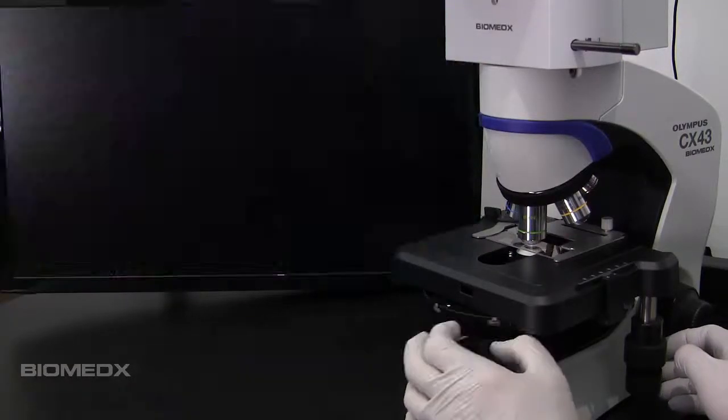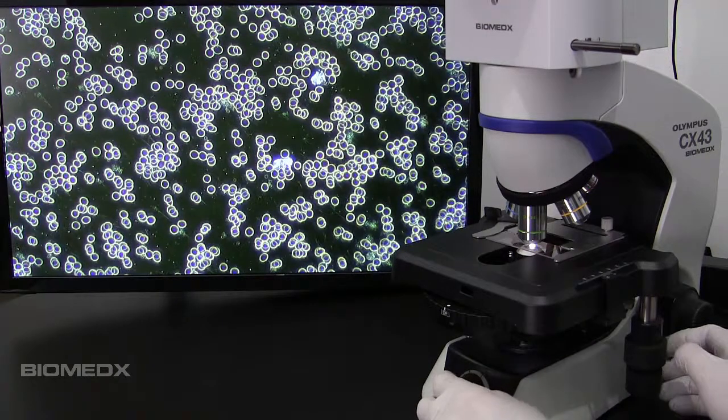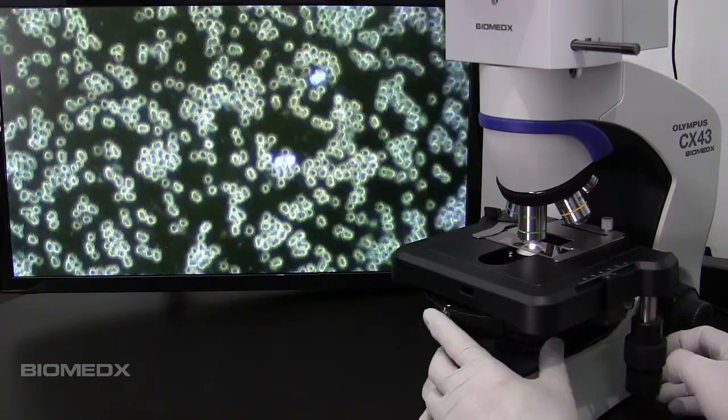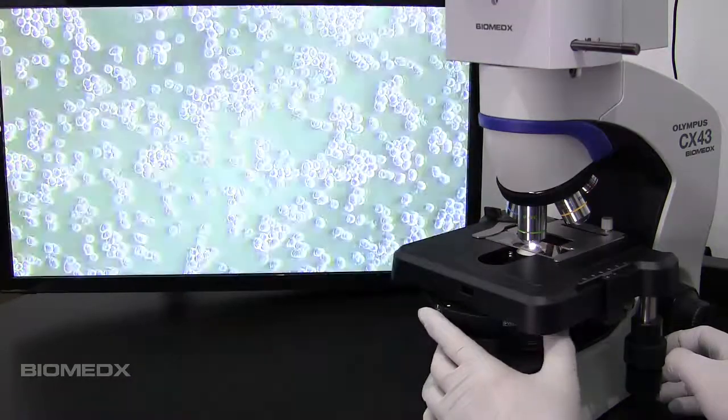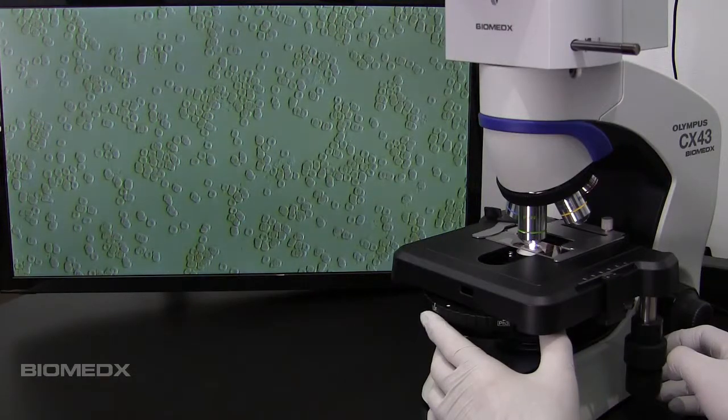We are looking here at different modes that we can engage with our Biomedics configured Olympus system. This right here is darkfield. You can see how with a simple adjustment on our built-in condenser that we can get a 3D perspective on our specimen, somewhat similar to differential interference contrast.